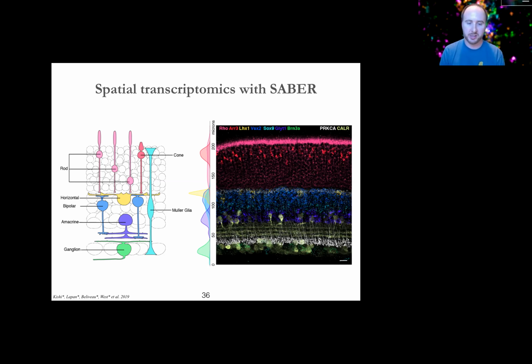So we did this in mouse retina using already known markers from Connie's lab, so we kind of expected to get the picture we're getting. But it's still very satisfying, all that said, to see it. And I think from a discovery angle, the SABER technology is fantastic and really well suited for applying the same kind of methodology where the underlying cell types and their distribution aren't as well known.